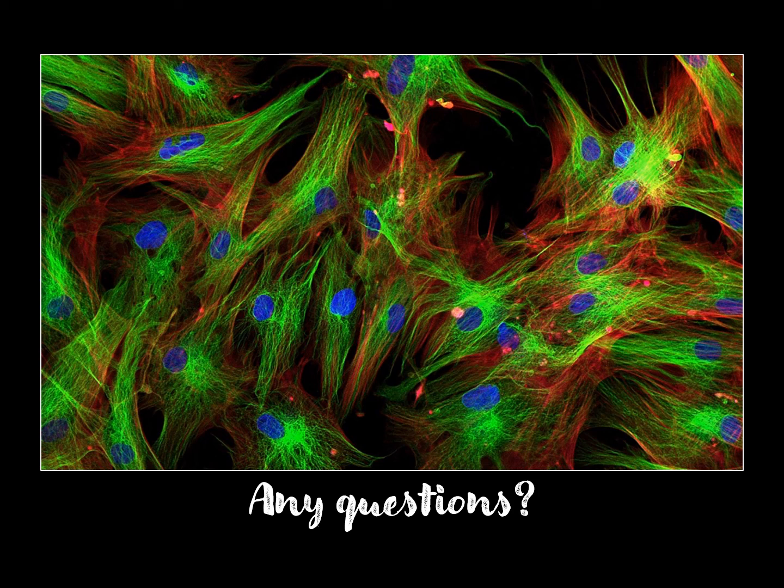So this brings us to the end of this specific lecture. Over here, we just simply introduced the concept of immunofluorescence and what are the key components of a fluorescence microscope, and how a fluorescence microscope works in very brief, just the very basics that are required from a biological point of view. As a user, these are the basic things that you should know when you're going to perform immunofluorescence.